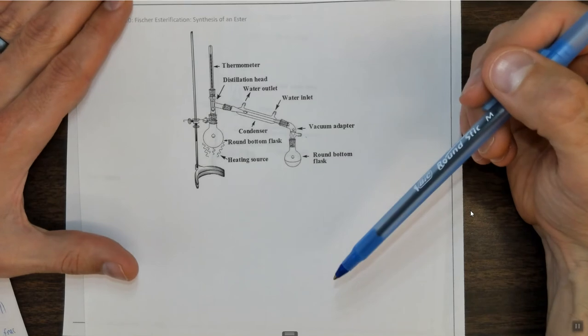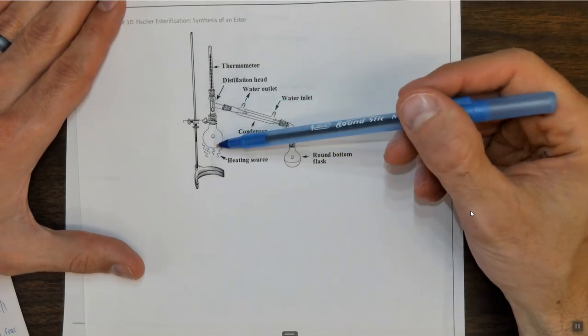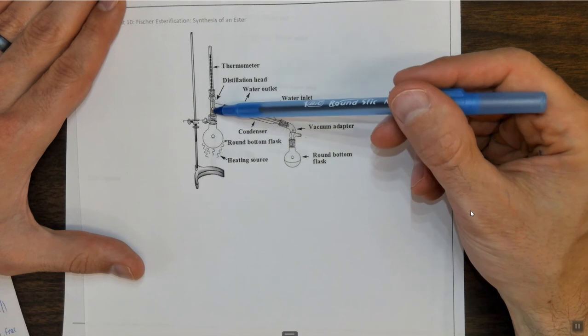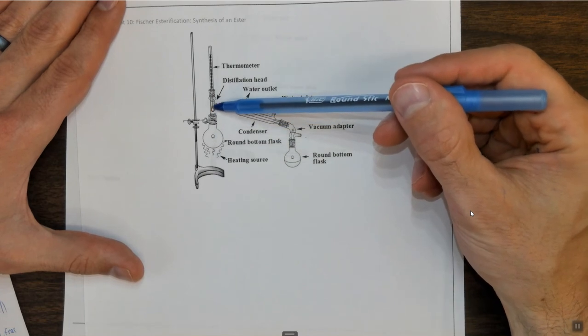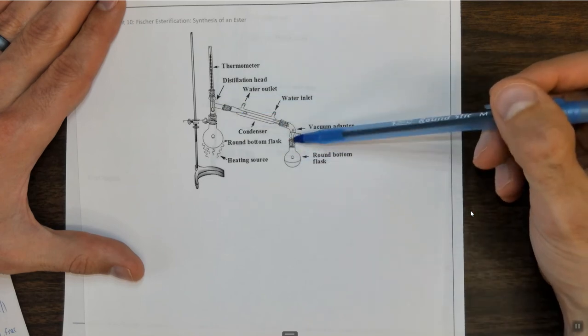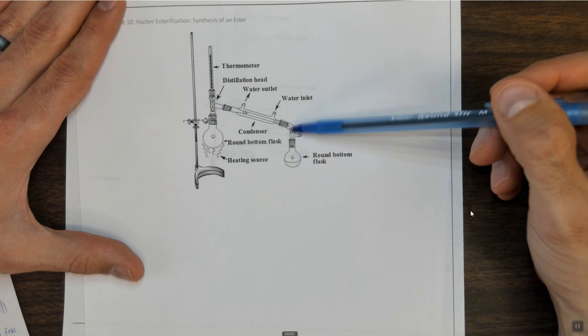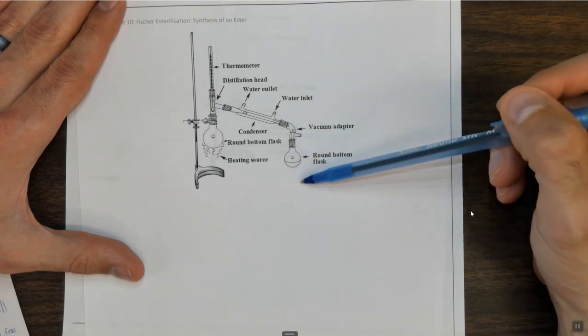So here's what we're going to do. You're going to take a heating mantle and you're going to heat this up. Ether is going to start to boil. You're going to notice that this temperature goes up to around 35 degrees C, and then you should start to see stuff dripping over here. Note that you want it to drip fairly slowly. You don't want it to be dripping really, really fast.